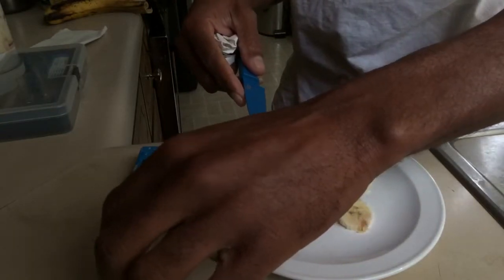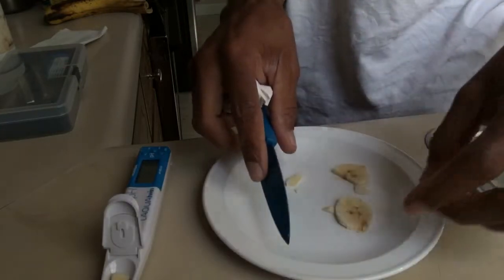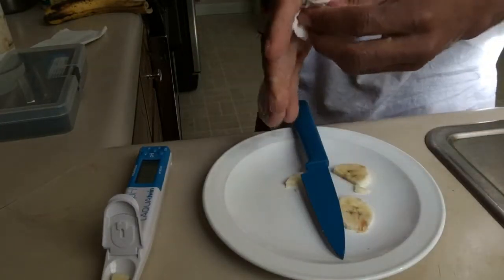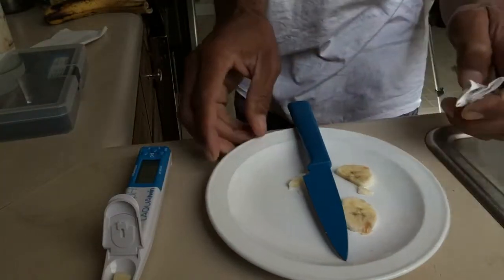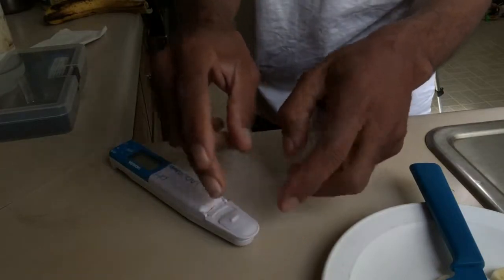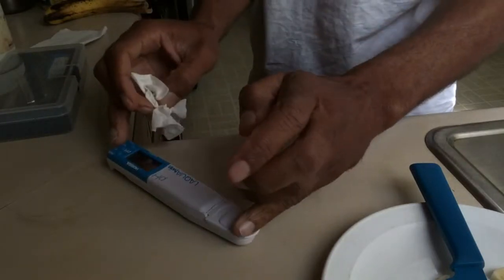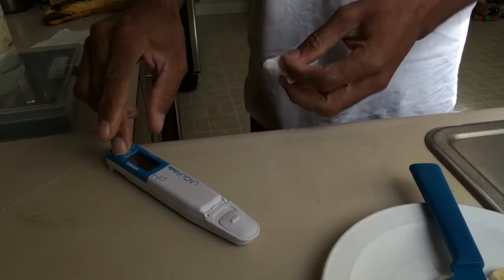I just put it in there and now it's in there. I'm going to close the lid and see what kind of pH we're getting.